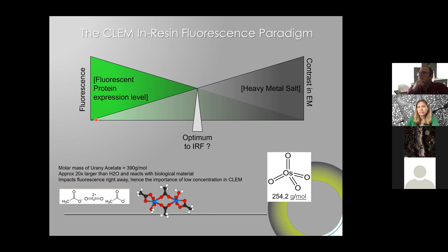The problem is that when we do this freeze substitution, we come up with fixatives and with some stain. These come and fix the proteins together, and somehow they prevent the molecules from resonating. That's one of the key points: the GFP has to be able to vibrate to be able to fluoresce. If you put too much fixative, or a resin that tends to attach to groups like amine groups in the epoxy resin, then you start to prevent this vibration, and the GFP will not vibrate anymore.